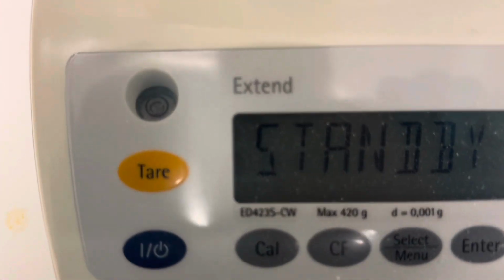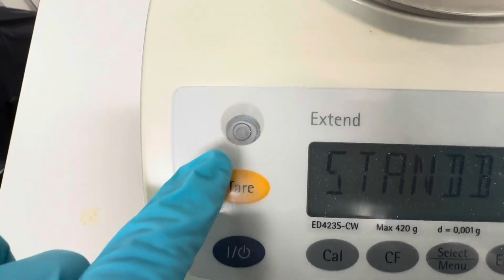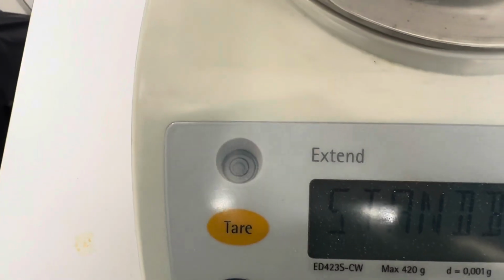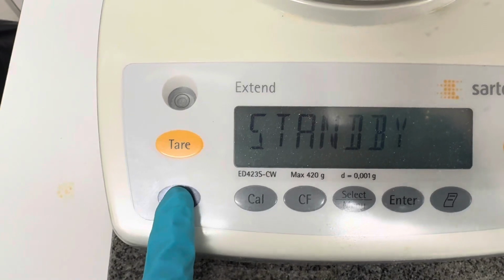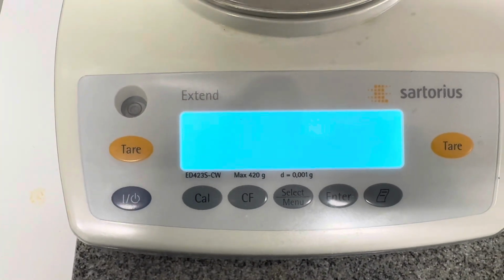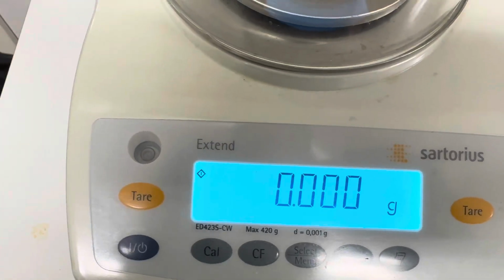Alright, now you can see that this water bubble, let me emphasize this, yes, so this water bubble is inside this black circle, which means that now our machine is balanced, and now we can turn it on with this button. Alright, so now we can start weighing our compounds.